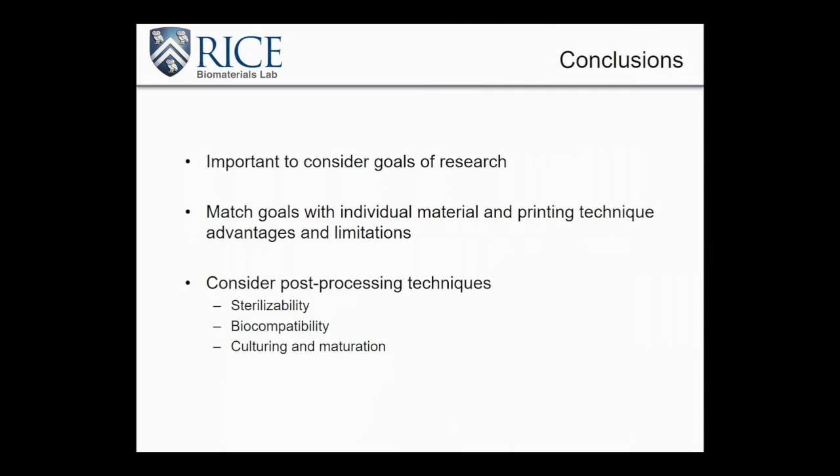So my hope is that by providing this background, you can consider the goals of your research, what's most important, whether that's resolution or the type of biomaterial you're including in your bioprinting process, and how those goals align with each of these different printing processes. You want to make sure that at the end of the day, you're probably not going to be able to print a perfect tissue with perfect performance or perfect resolution, because none of these techniques can quite be used alone to do that. So you have to figure out which limitations you're okay with compromising on.